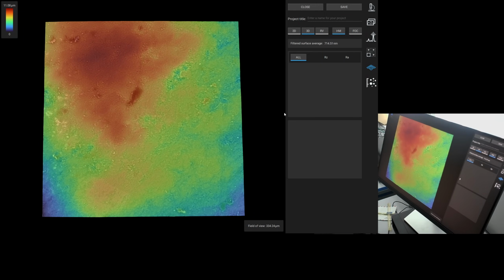Let's go and see what the variance is over the distance here. So that looks like the highest area, and we'll come down to the lowest area. So you are looking at here, this is a 10.9 microns down to 4.2, so about 6.5 microns is the maximum variation across that high point to this point down here.